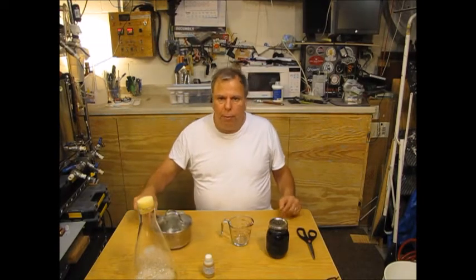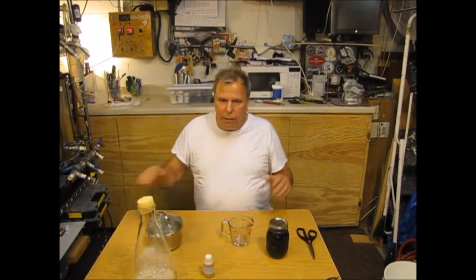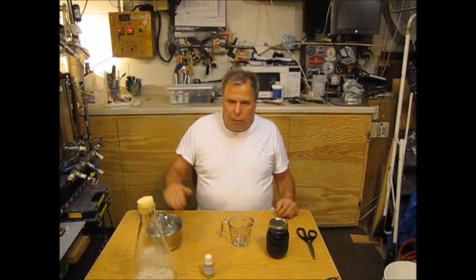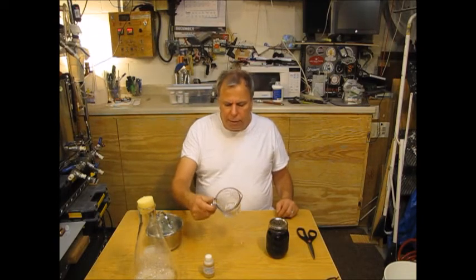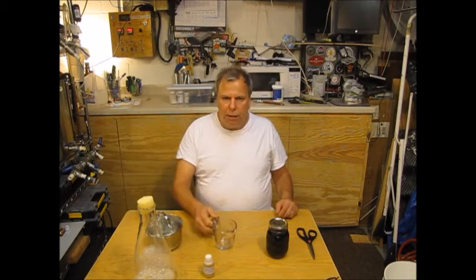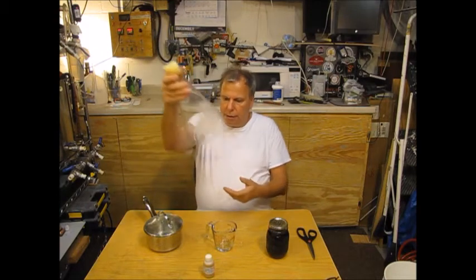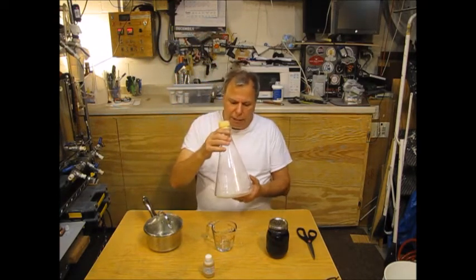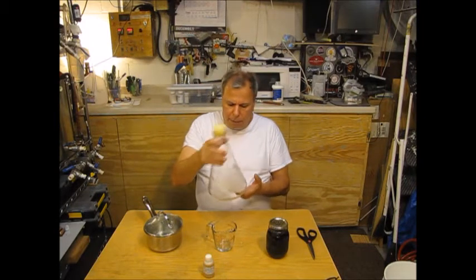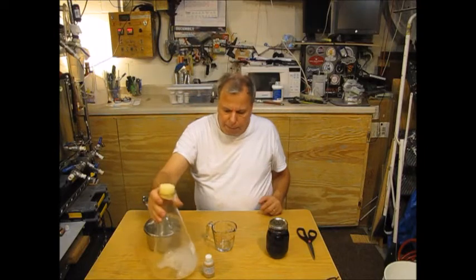Here I've got some water that I boiled and cooled down to room temperature. I've got a sanitized measuring cup rinsed out with Star San, and my two-liter Erlenmeyer flask that's already got some Star San in it — sanitized with a stir bar already inside.